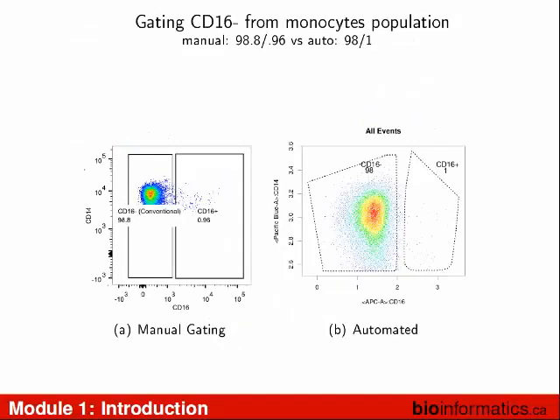So some examples here, comparing manual versus automated analysis. Manual on the left, automated on the right. Some examples of things that are perhaps easy to find. One thing that tends not to be easy for these different algorithms to find is rare cells that are off in space. There are a couple of dots that are separated from these other dots, but there's no line that makes any statistical sense. This is what I was kind of hedging on, what's done by statistics, this example I was thinking of.